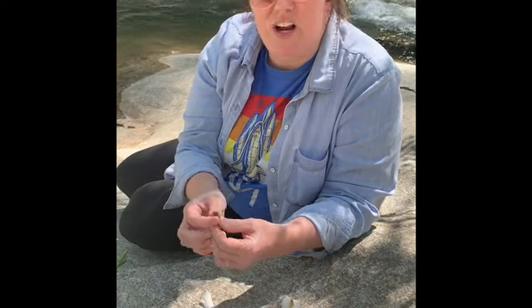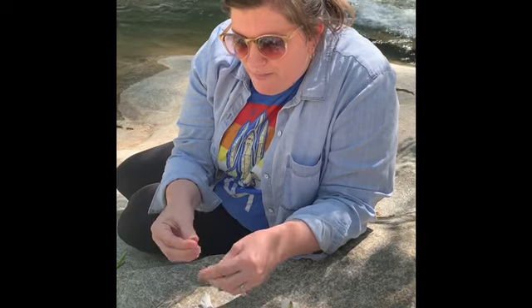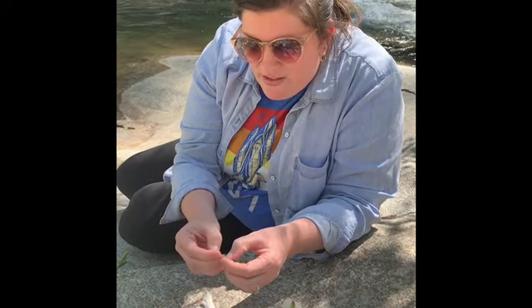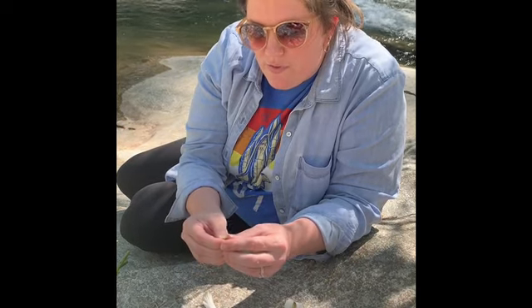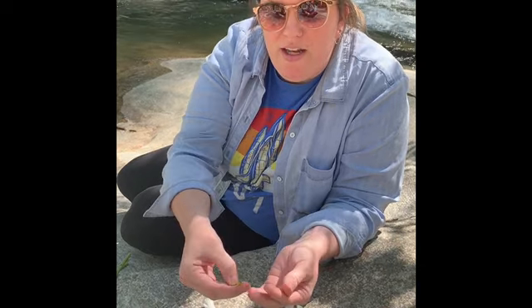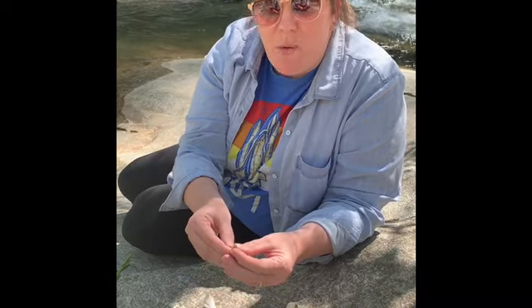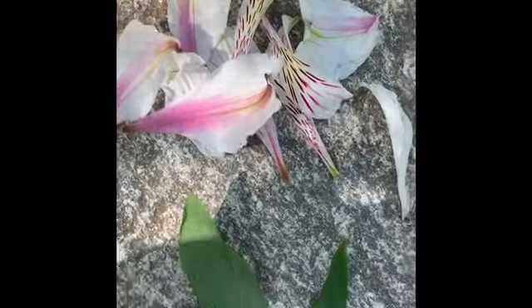Alright, and this right here is the ovary. Whenever I open up this ovary, you can see these little seeds, and these little seeds are ovules. Alright, ovules. So that is where the pollen goes, and it fertilizes the ovules, and then that's where baby flowers are born.